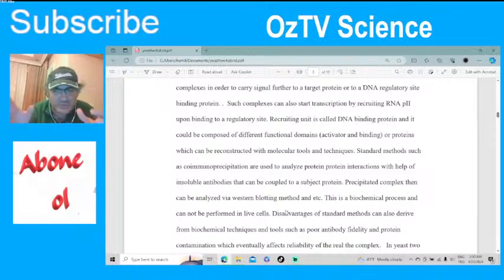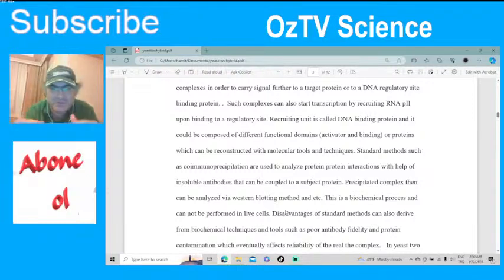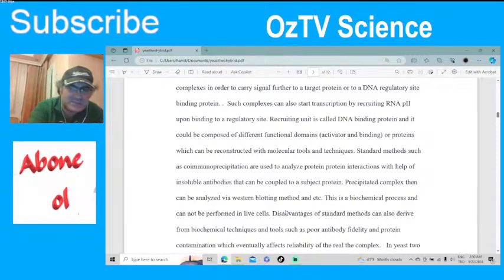So if those two proteins of interest are forming a unit together in the cell, they will bring the activator and binding proteins together, so you will have an expression of a gene. But say you are studying X gene and Y gene, and they work together. You don't know if the X and the Y proteins are working together in the cell. They bind and they form a complex, and you can test it with this system.